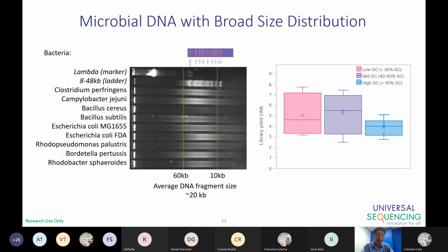You can see, again, I have not mentioned this yet. For long-read sequencing or long-range sequencing, one of the important criteria is you want to start with high molecular weight DNA. In principle, the better quality high molecular weight DNA, the better the result you will get at the end, either for long read or linked read. For this particular case, the Illumina team just used commercially purchased DNA. Its average performance is not too bad and not too good.